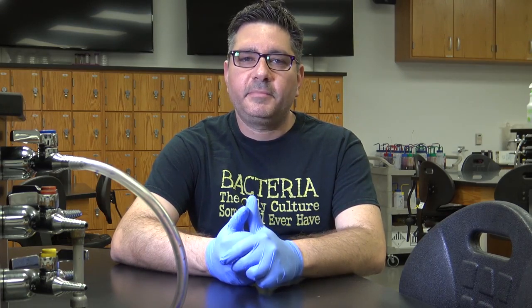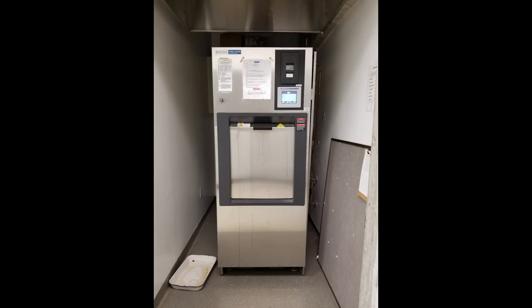The autoclave accomplishes sterilization by creating an environment that is not hospitable for microorganisms. In order to sterilize a medium, a microbiologist employs the services of this device. An autoclave raises the temperature and pressure within the chamber. Traditionally, we autoclave at 121 degrees centigrade with a pressure of 15 psi, which is maintained for 15 minutes.